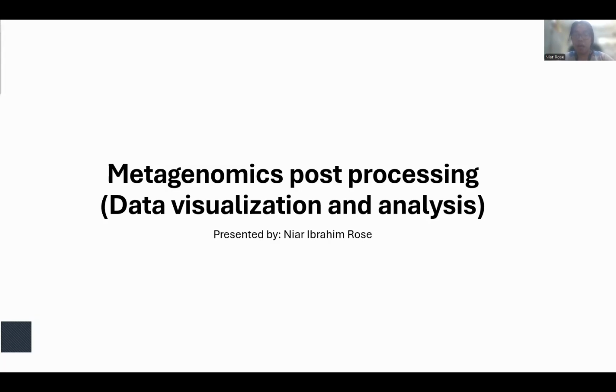And today, I'll talk about metagenomics post-processing, data visualization, and analysis, which follows my colleague Vikran. He presented about the metagenomics pre-processing, and today I'll continue his work.